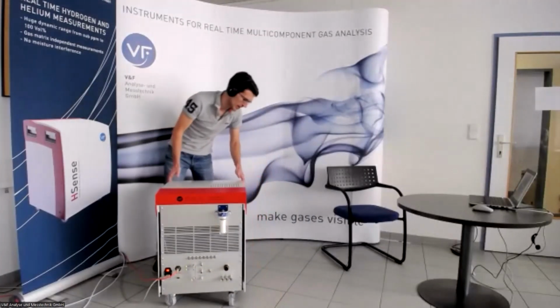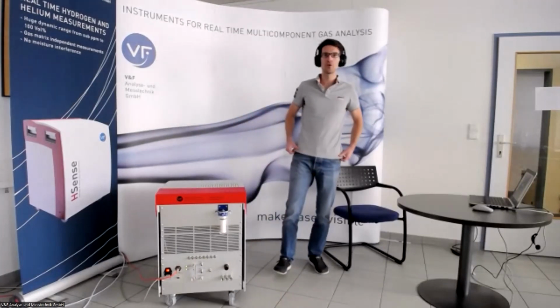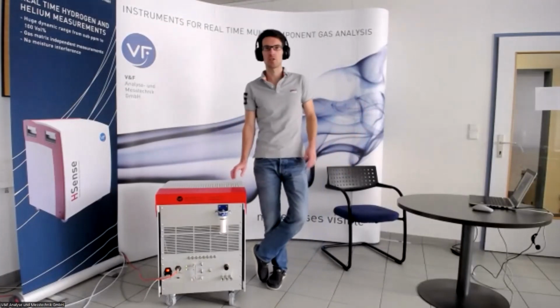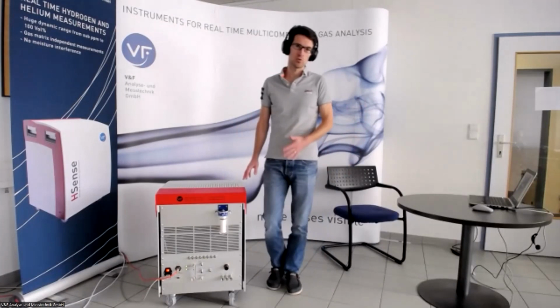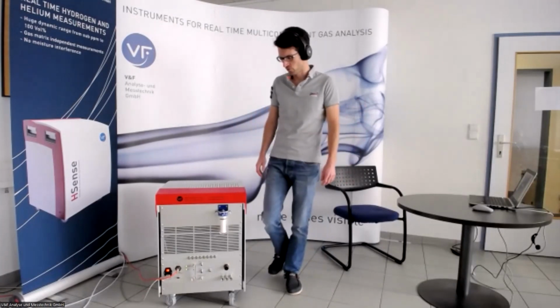So any kind of angular momentum that you put on the instrument is not really appreciated by this pump, which is why we usually recommend for the customers to place the instrument at a certain location, and as soon as it is in operation, you would not move it until it is switched off, the turbo pumps have run out, and then it's safe to move again.